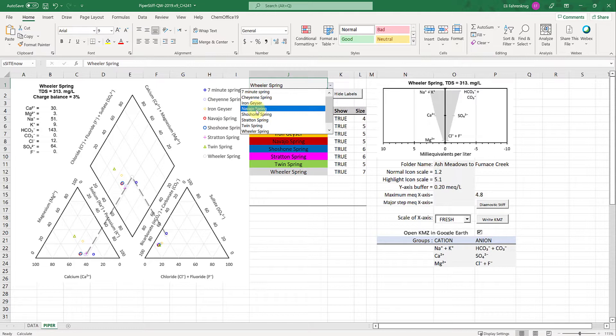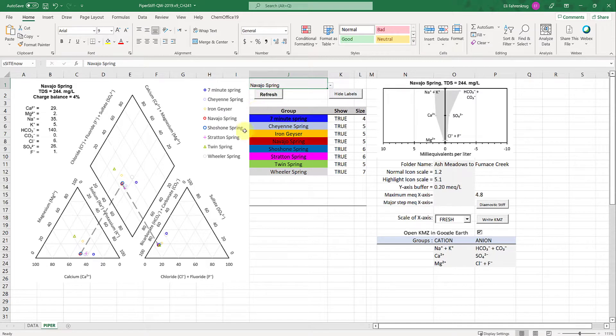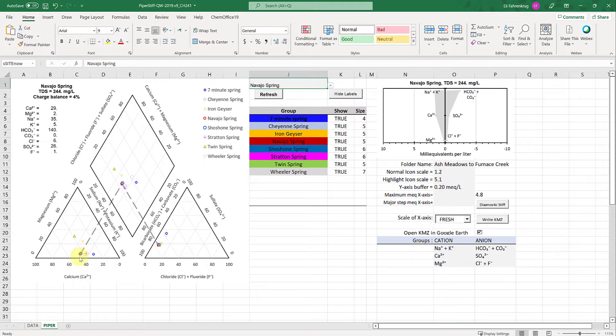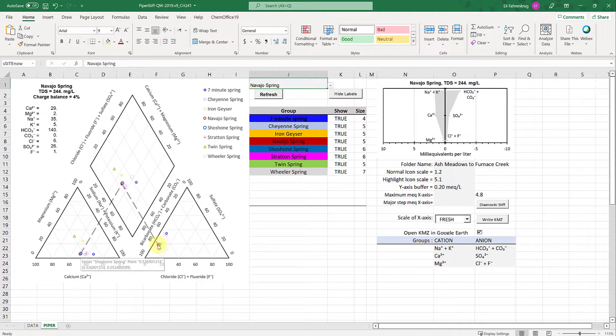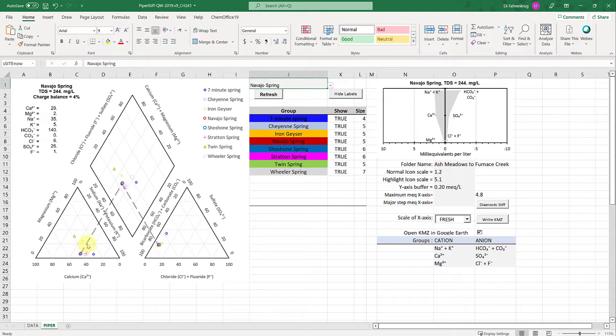If I want to compare Navajo, you'll see this light gray dashed line. That's telling me here is the cation concentration for Navajo spring, here is the anion concentration on this triangle, and here are the extrapolated lines to the point up here.